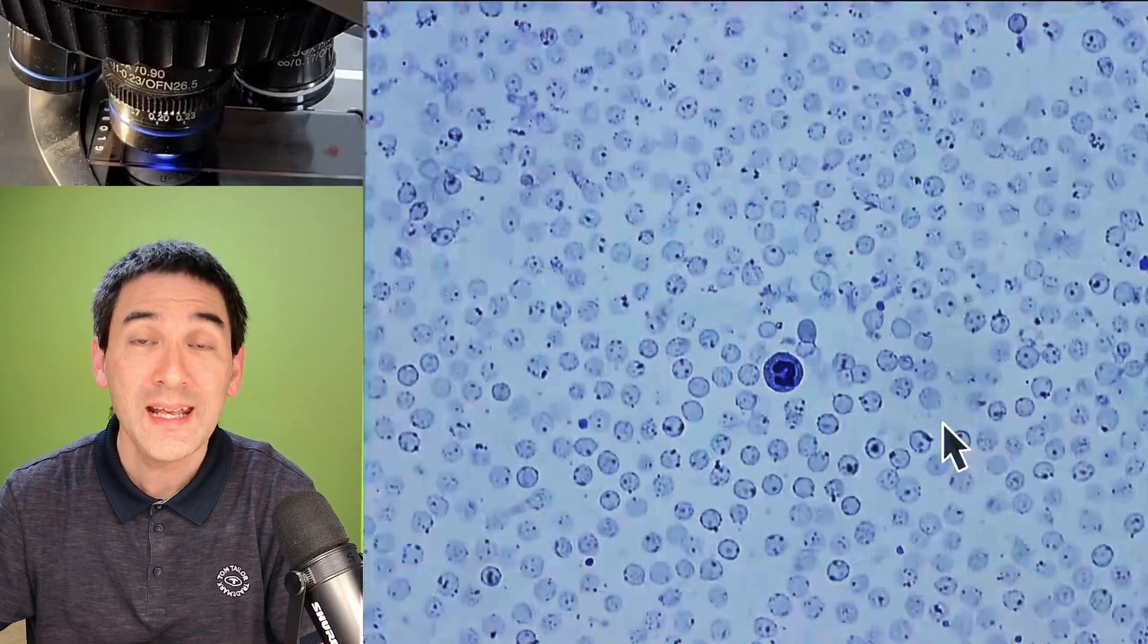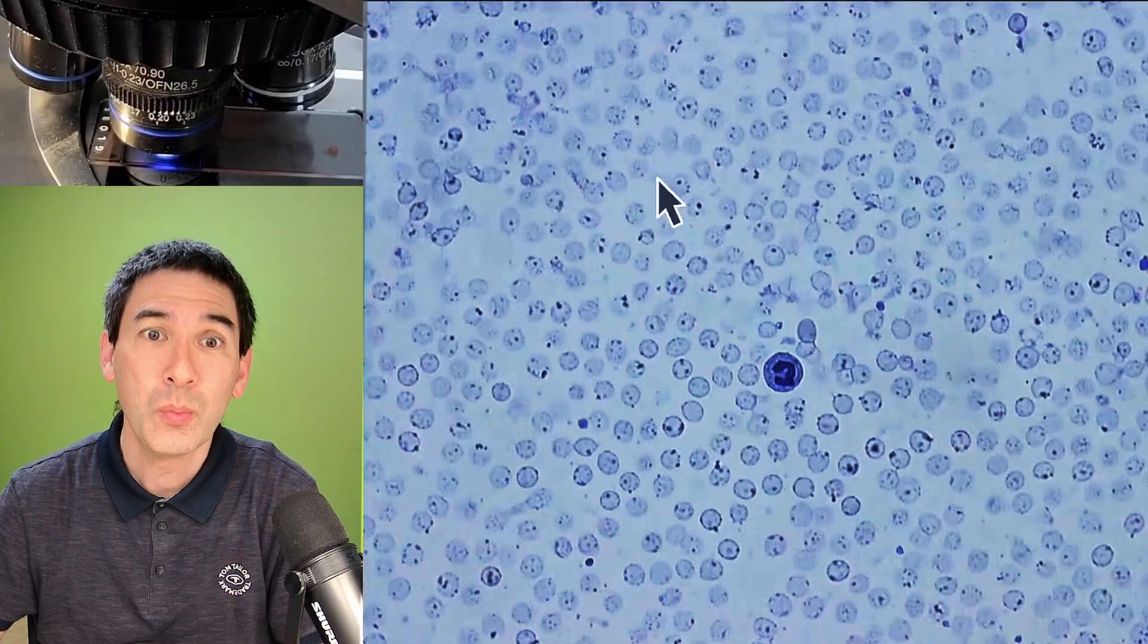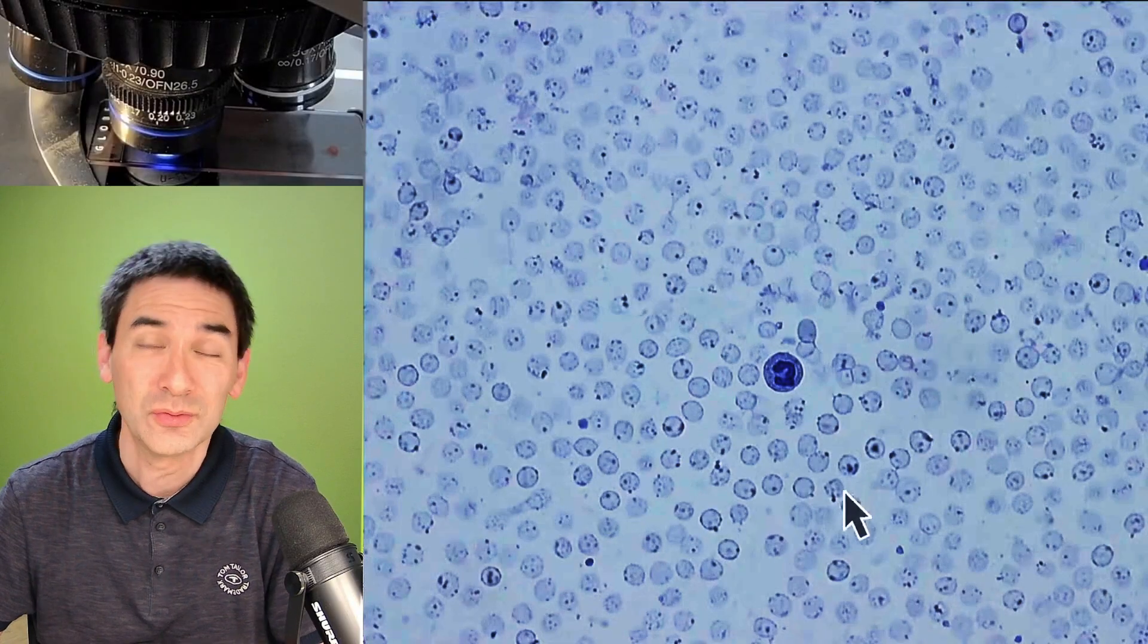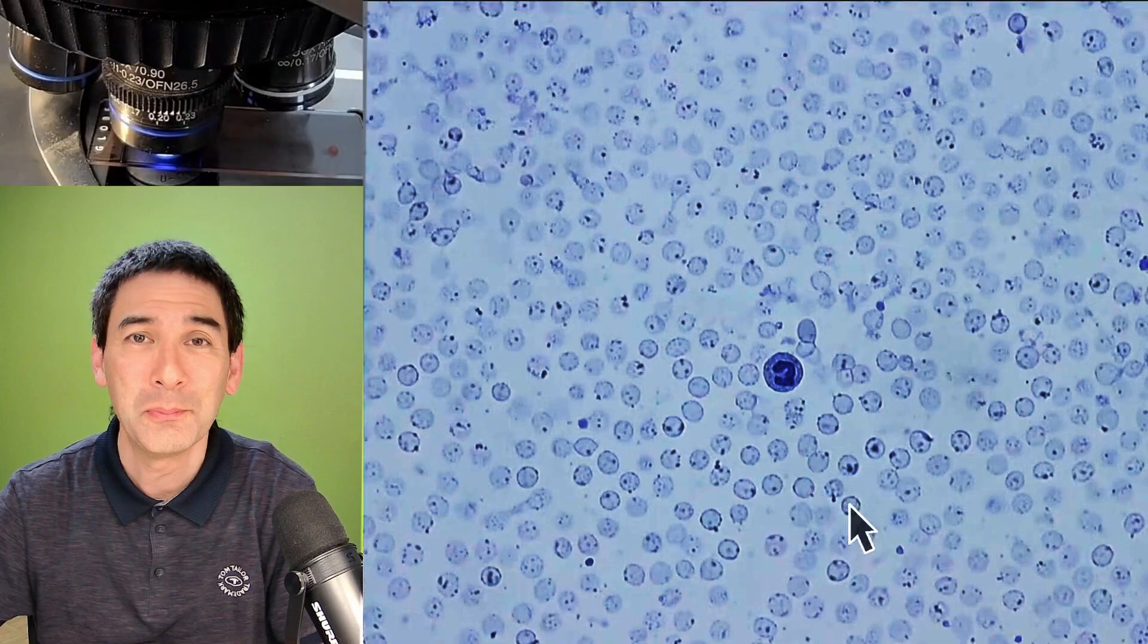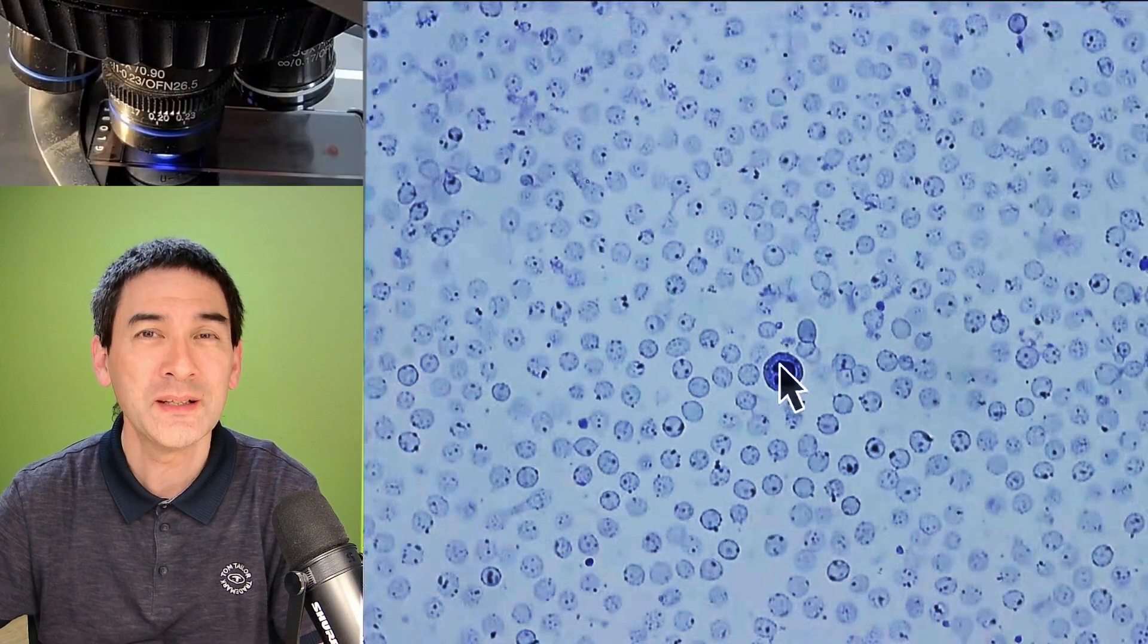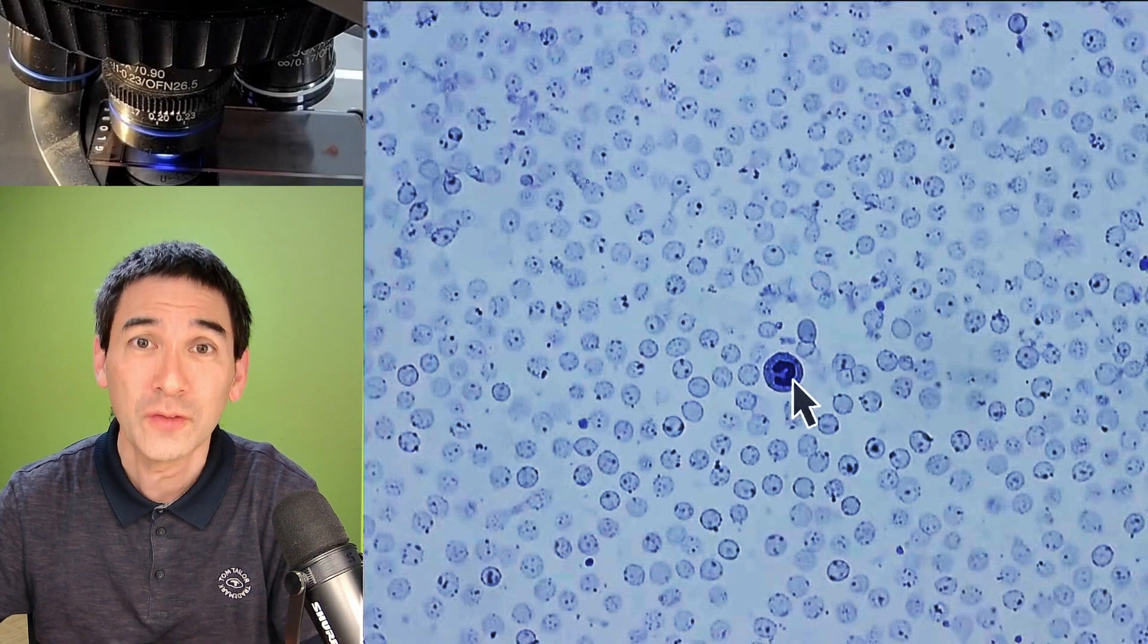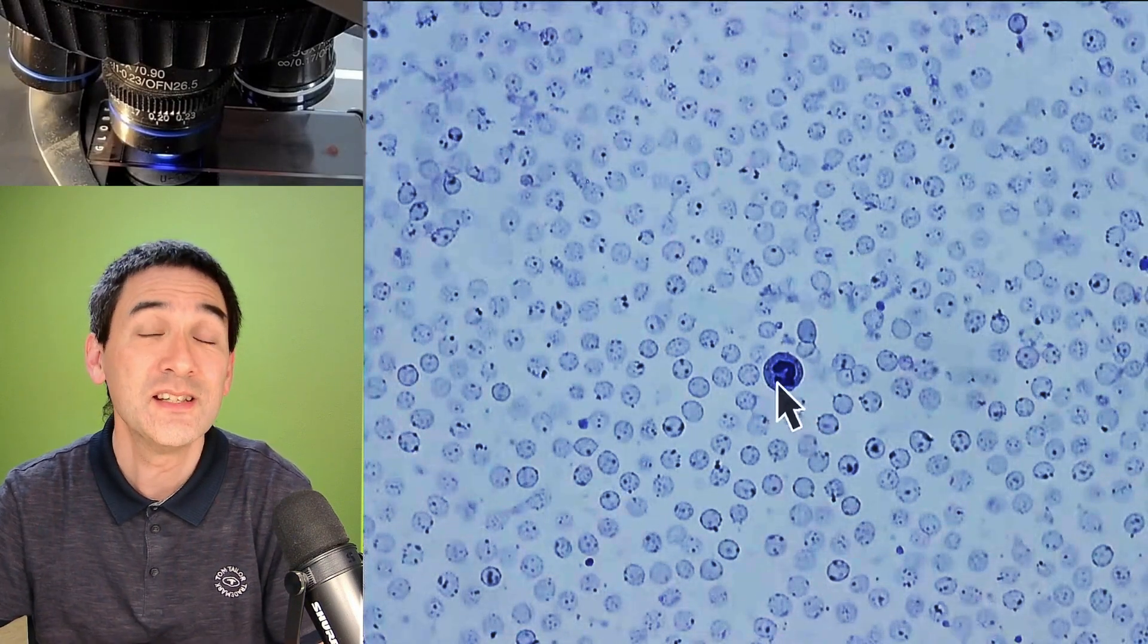I'm just removing a little bit of the excess stain and here in the center we can already see a white blood cell. The red blood cells around it have a little bit lost their shape. Maybe some of them started to break up because of the alcohol but the white blood cell in the center is actually quite nicely visible and you see that in the center of the white blood cell there is a darker irregularly shaped region and that is the nucleus.